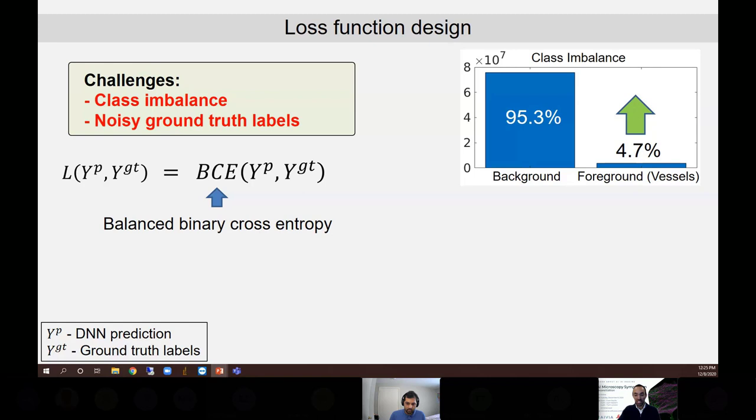So that's actually a very interesting question. Ideally, you would let the deep neural network do the segmentation and the denoising, or train a deep neural network for denoising. But what happened was that our training data, which was very old, wasn't very noisy. So our trained deep neural network has not seen noise. Now if you want to generalize to new data that was very noisy, for that we came up with this denoising method, which just worked really well for us. And I do think that we need some more intelligent pre-processing or denoising, because we clearly see that with the current denoising method, we do have those problems behind the large pial vessels. So that's actually an interesting suggestion.